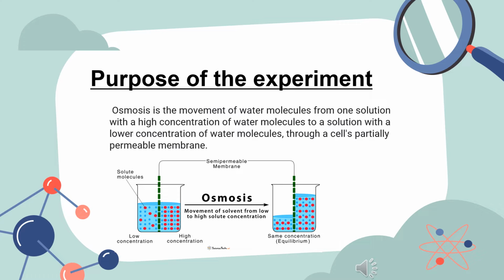When you put the gummy bear in water, it is a solute, and the water molecules are a solvent. Since the gummy bears do not contain water, since they have gelatin, the water now moves through the gummy bear through the process of osmosis. Osmosis is the diffusion of water molecules from a dilute liquid to a more concentrated solution, as you can see in the image, through, of course, its selectively permeable membrane.